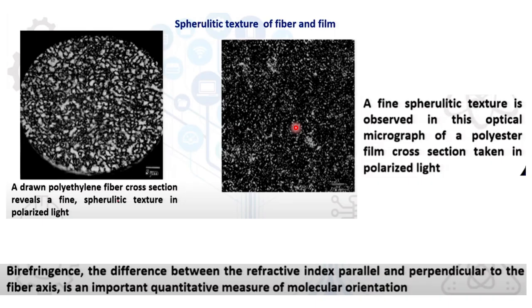With the polarized microscope, you are making polarization of the light through a specific angle. Now, what is the importance? The importance is, if a material is crystalline in nature, or it has a very high aspect ratio, for example, if you are using a very high aspect ratio fiber to make a composite, through polarized light you can check in which direction the fibers are aligned.